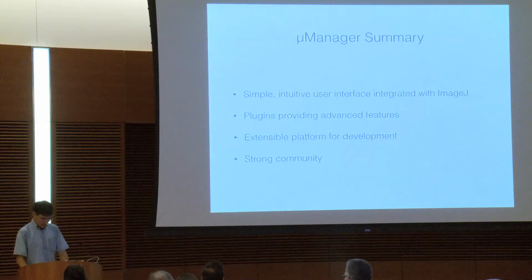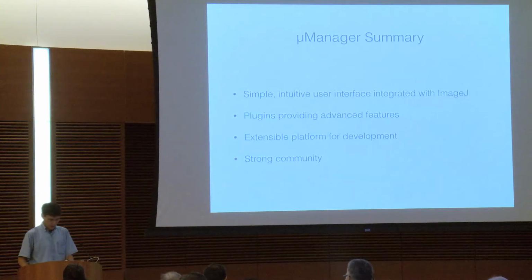So I just want to summarize everything about µManager. I hope I've convinced you that it has a simple interface for running basic experiments. And we have a lot of plugins and keep getting contributions of plugins for various advanced features.